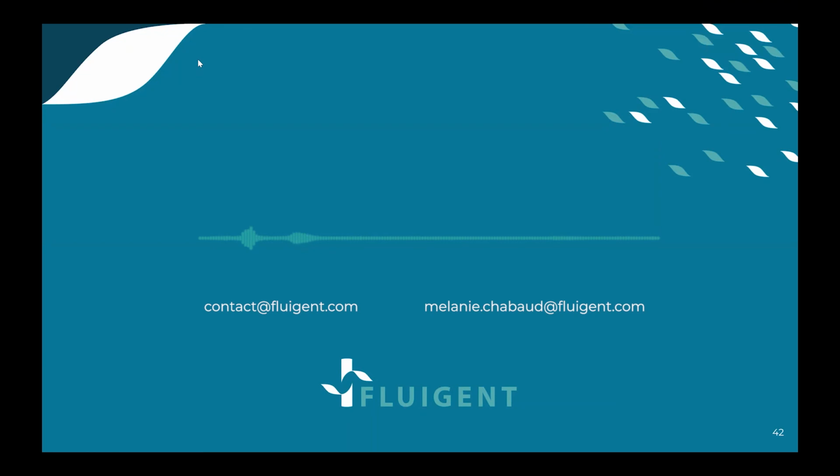Thank you. And for your second question about the mixing, yes, indeed, you can clearly see, especially with the dyes, it's very easy to see that the solutions are mixing along the fluid lane. That's why we suggest to do a flush. There is this order called tubing flush in between two solutions to be sure that they are not mixed.